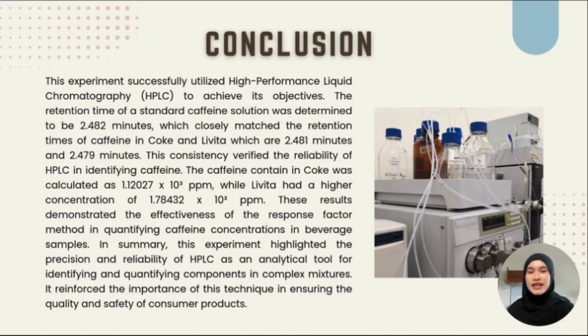In summary, this experiment highlighted the precision and reliability of HPLC as an analytical tool for identifying and quantifying components in complex mixtures. It reinforced the importance of this technique in ensuring the quality and safety of consumer products.